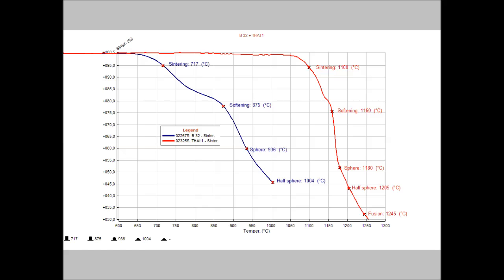The images collected during the test are automatically analyzed to identify the typical temperatures of the material under test. This graph shows the result of a softening test carried out using the MISURA standard, which identifies the typical temperatures of sintering, softening, sphere, half-sphere, and fusion.